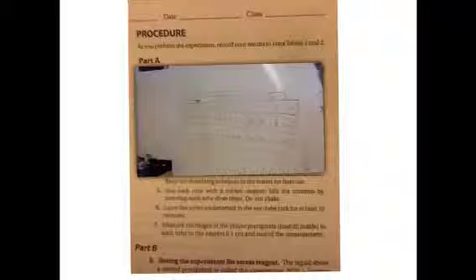Once we filled them up and mixed the contents, stirring them instead of shaking, which was a little adjustment to number 5 in our procedure, we just stirred them with a stirring rod. After filling up these 6 test tubes, stirring them, and then letting them sit, we have another set, and then we have our data table.